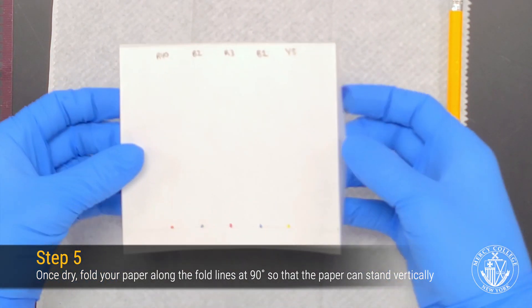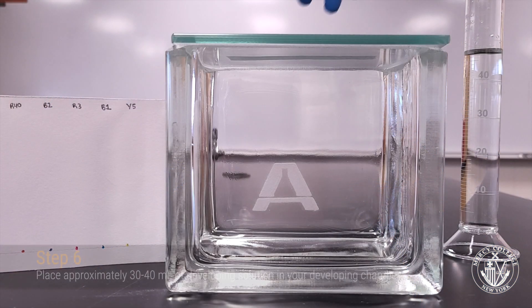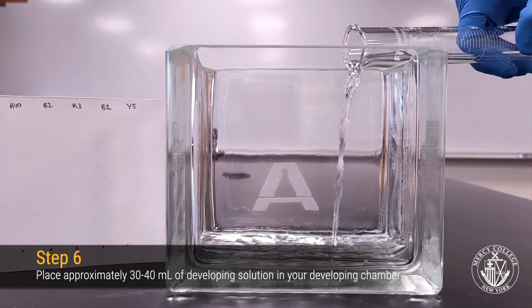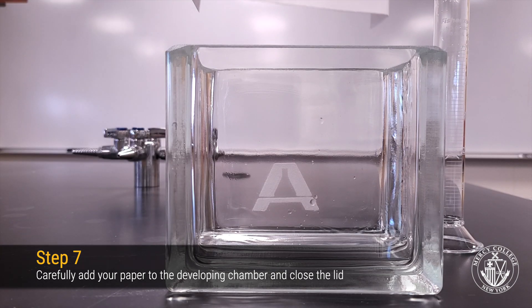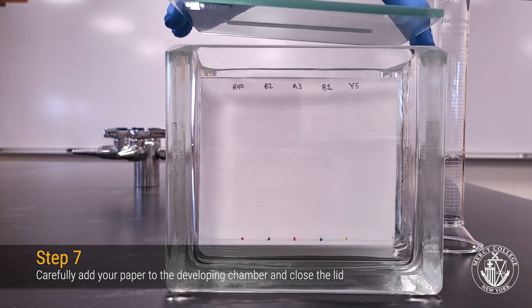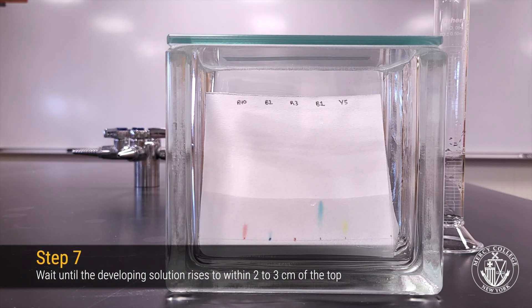Once you've spotted and labeled your chromatogram, fold out the edges so that the paper can stand freely. We're now ready to develop our chromatogram. First, add about 30 to 40 milliliters of our developing solution to the developing chamber. This contains about 5% acetic acid or vinegar and 5% sodium chloride. Next, carefully add your chromatogram to the solution, making sure that the developing solution is below your baseline. Replace the lid on the developing chamber to limit evaporation of the solvent and slowly wait for the solvent to creep up your chromatography paper due to capillary action.